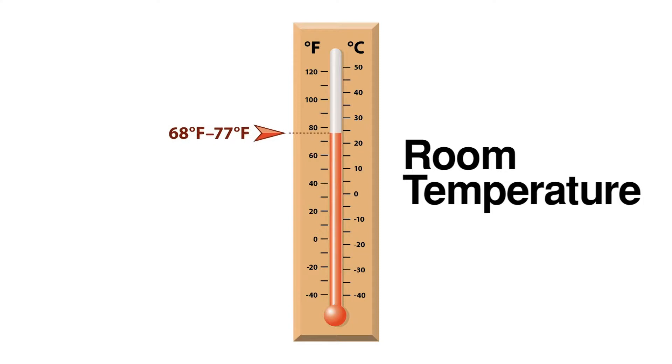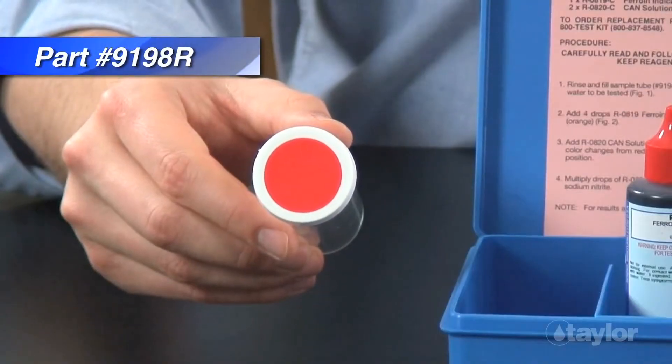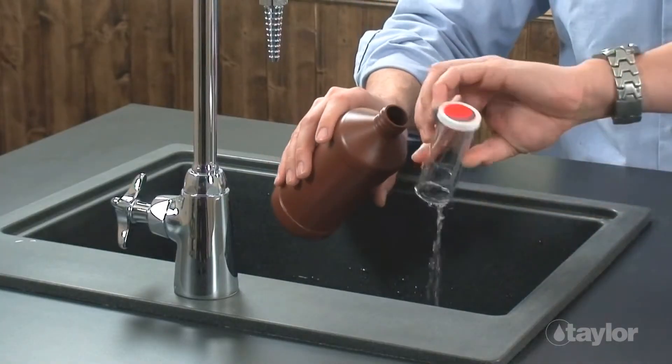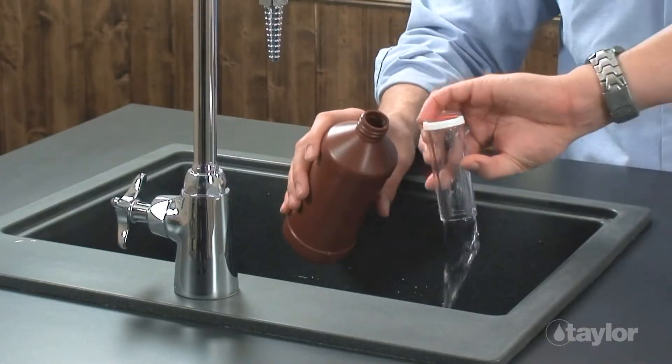Although most customers use the K1510 to test cooling water, if you are using it to test hot water, you must first bring your sample to room temperature. For this demonstration, we'll be testing cooling water. Note the red dot on the part number 9198R sample tube, which indicates it should be used with red cap reagents in a nitrite test.